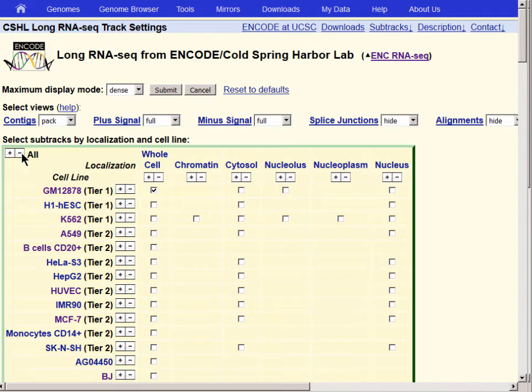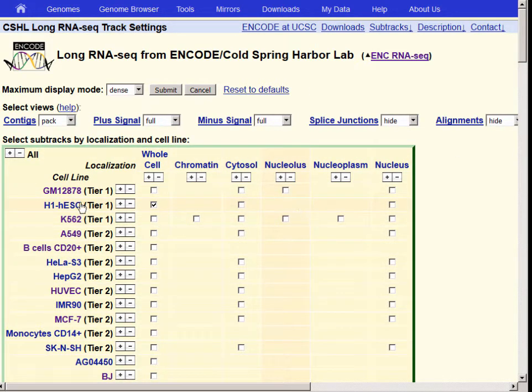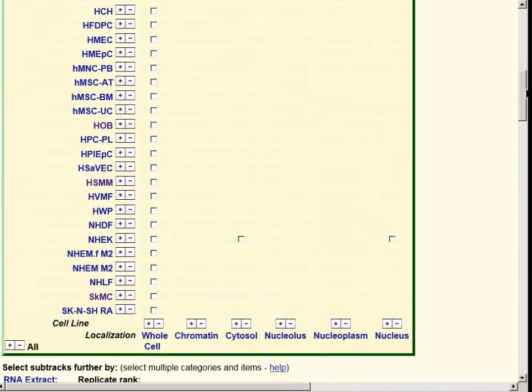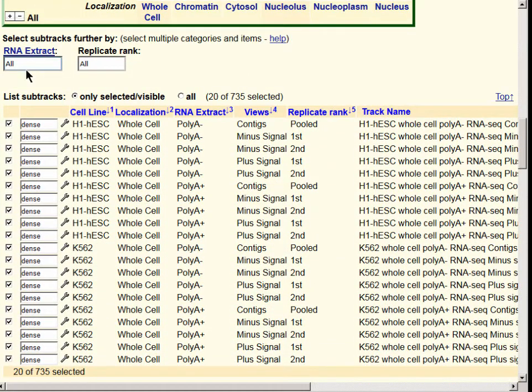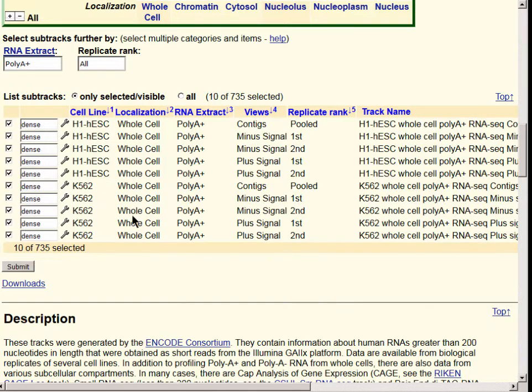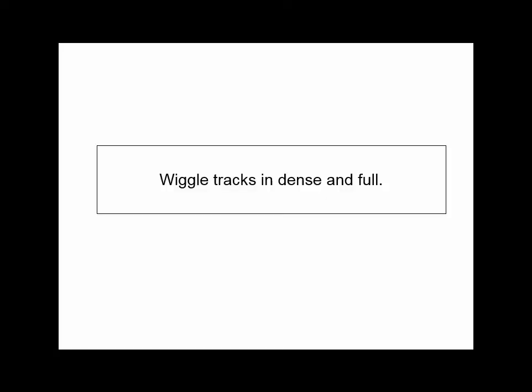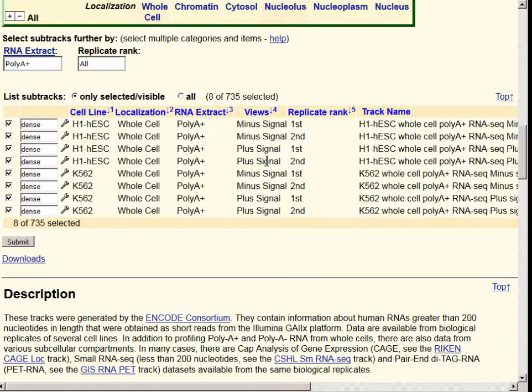Let's turn them all off by hitting the minus sign, then turn on the H1-HESC embryonic stem cell line and the K562 line. Both of these were in the ENCODE project Tier 1 — the ones with the most extensive data. We'll scroll down and choose just PolyA-plus data tracks and deselect the context tracks, so we'll be looking at plus strand and minus strand wiggle tracks in duplicate. There will be two replicates for each of the two cell lines. Remember that we set the composite track to full but have set the individual tracks to dense.